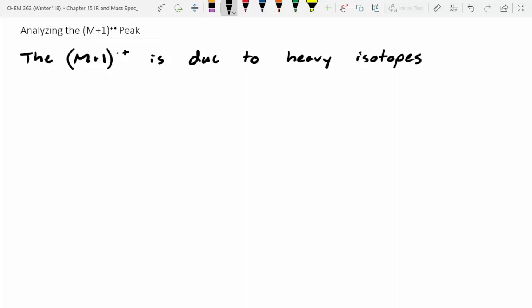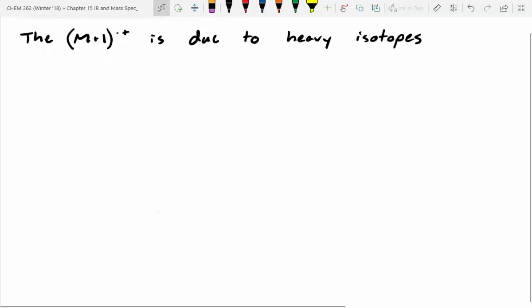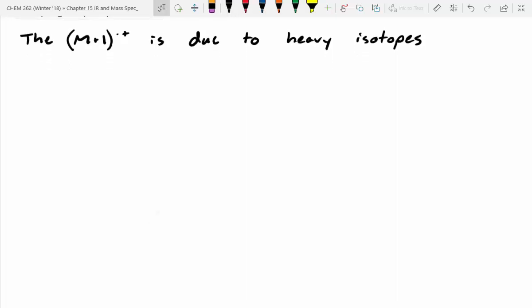All right, so I'll show you guys the most common isotopes we'll run across as organic chemists. Obviously, we'll focus on carbons, since that's what we do. Carbon is abundant at a 98.9% level, so it's obviously the most abundant form of carbon. Carbon-13 is abundant at about 1.1%.